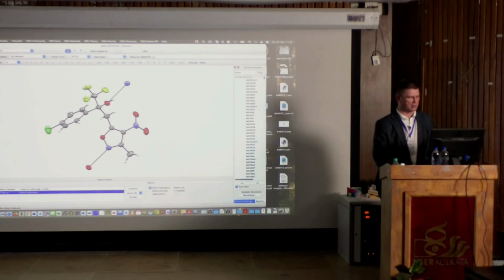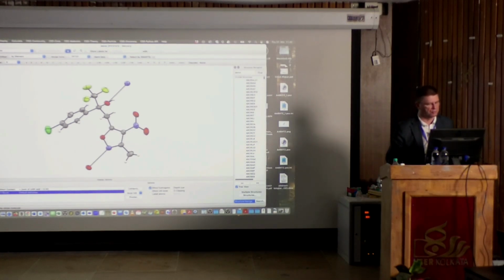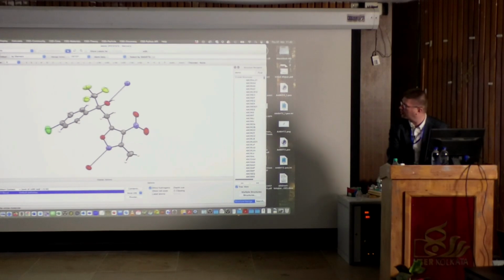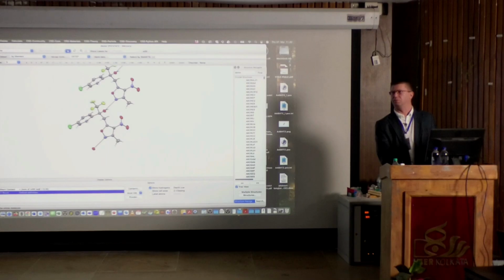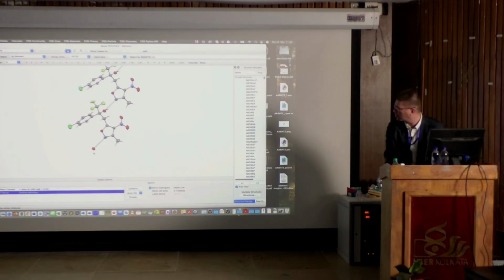But now, if you look carefully, you'll learn it later on, of course, we use here in the right-hand corner, it says expand contacts. So when I go on top of this and click, it draws the next molecule. And if I go here, now it clicks this one.